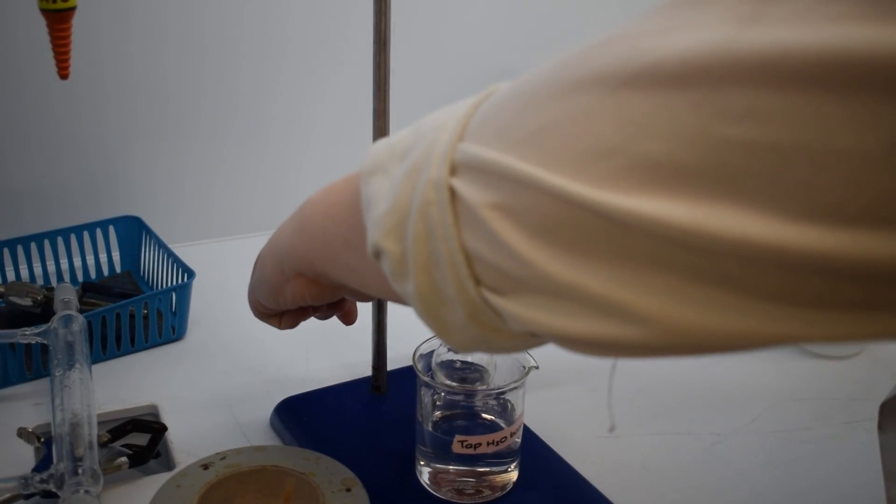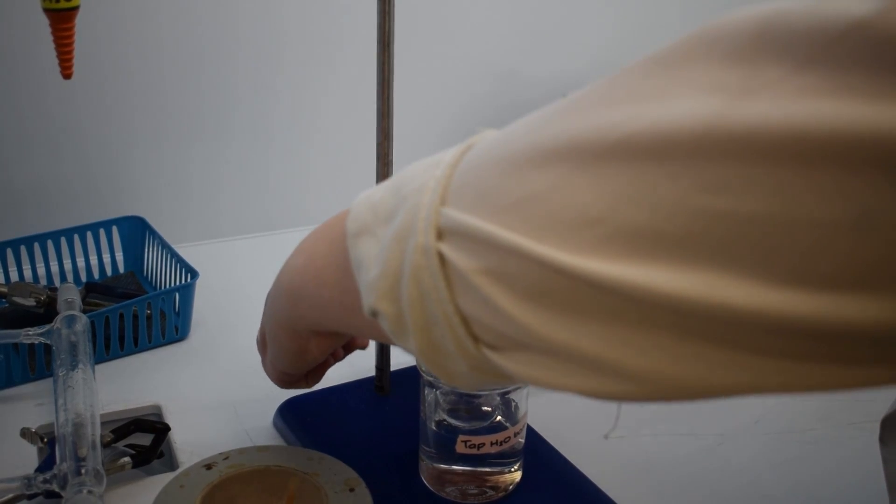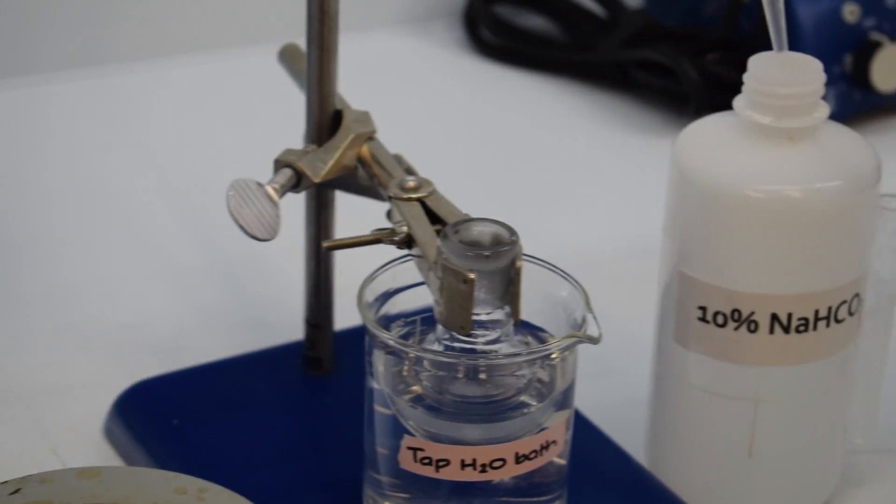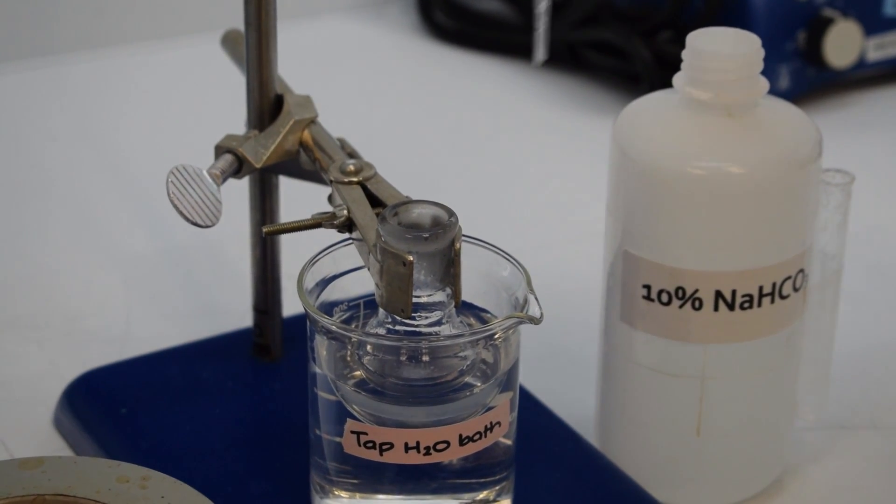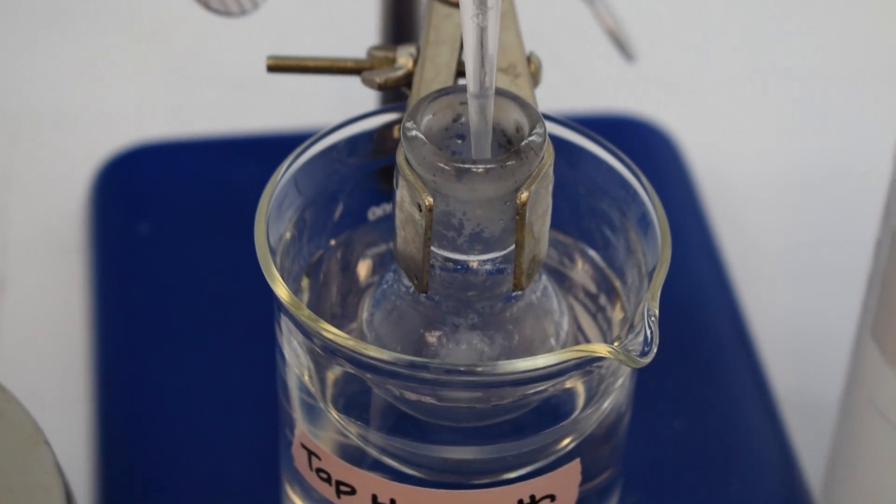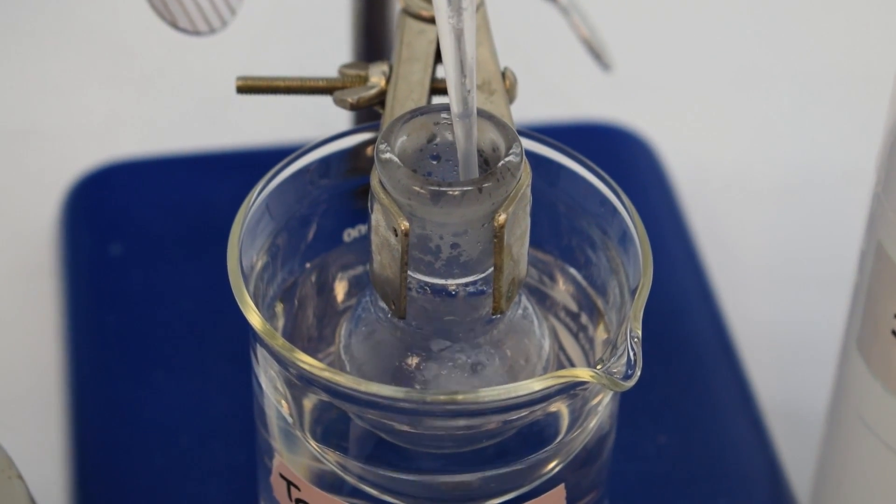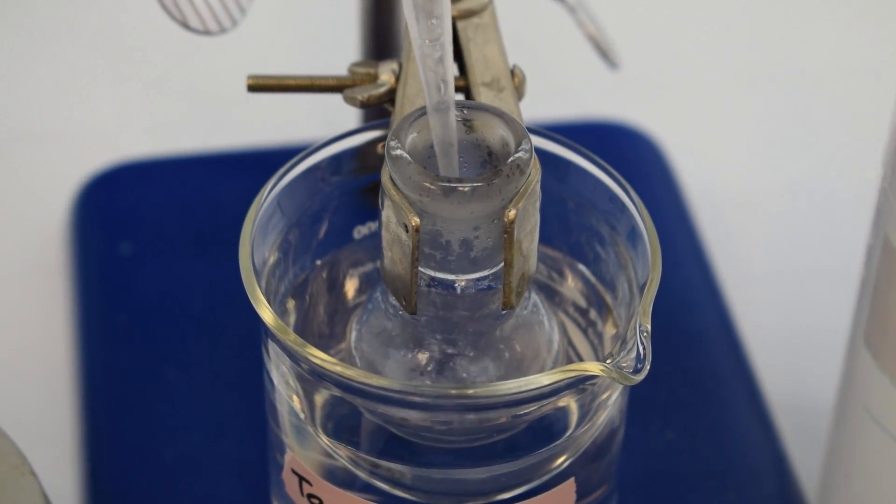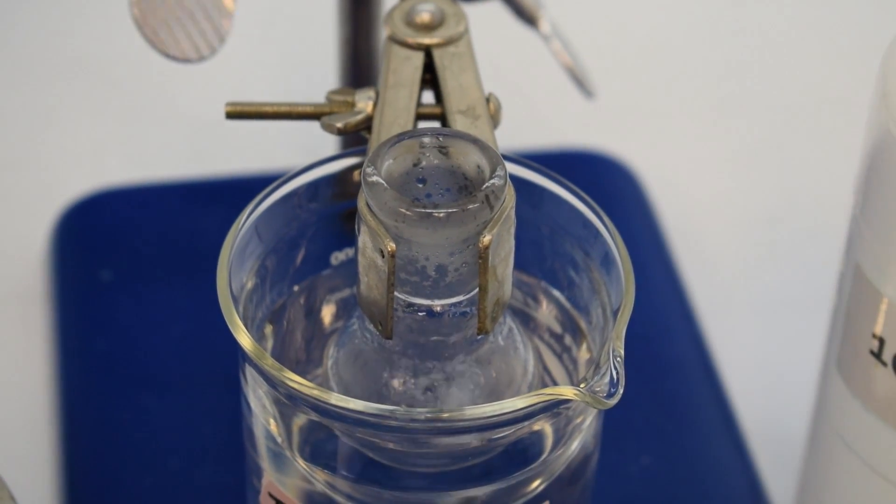Once the reaction mixture is cool, we will begin adding 20 milliliters of sodium bicarbonate to the flask one milliliter at a time. This will neutralize the acid, but it also produces aggressive bubbling, which is why we add it very slowly.